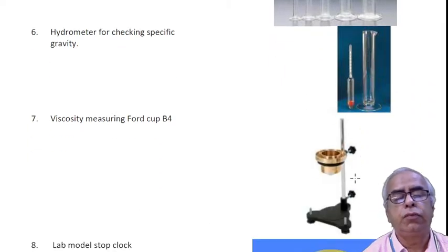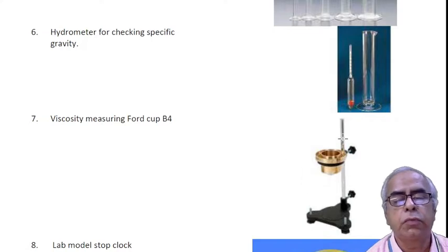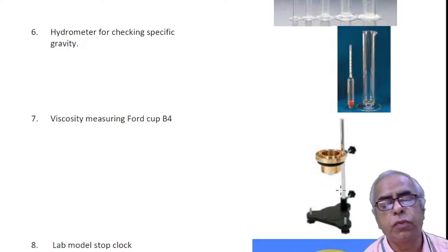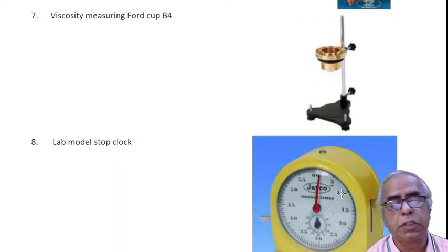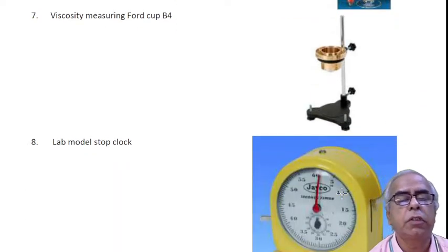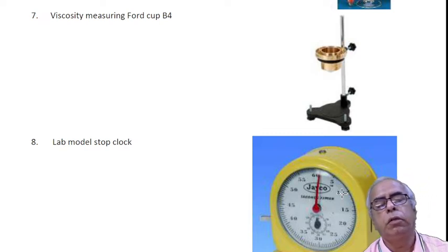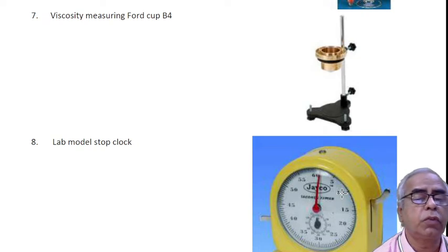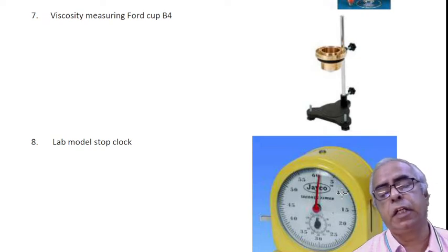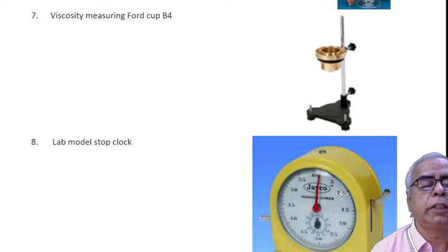This is called the Ford cup, Ford cup B4. This is useful for measuring the viscosity of paint or resins. It is given in terms of seconds or minutes based on the type of resin.